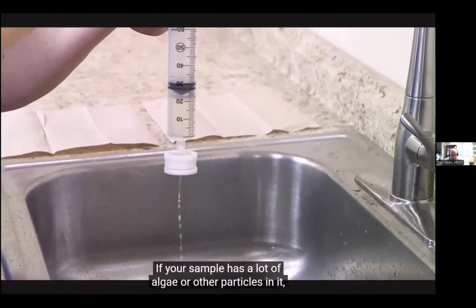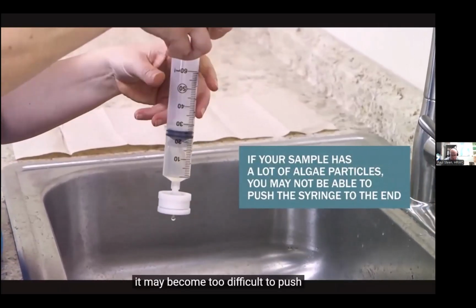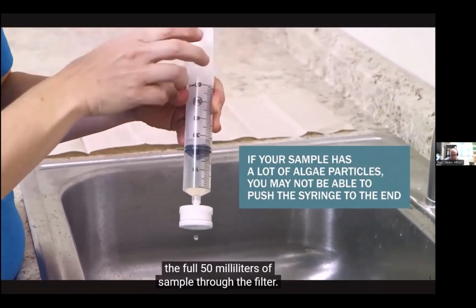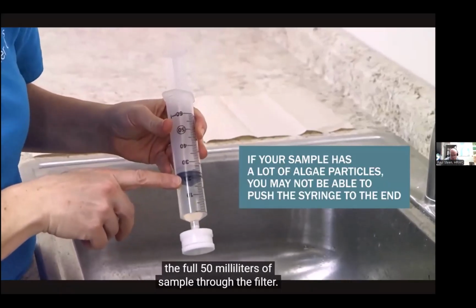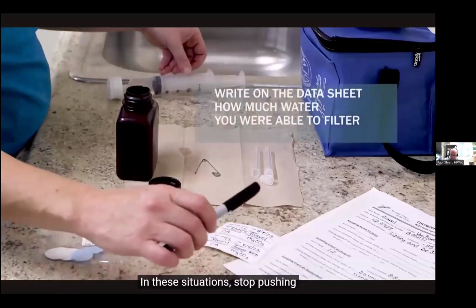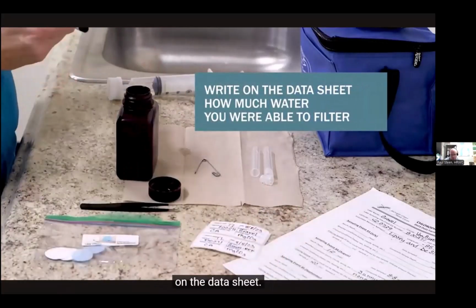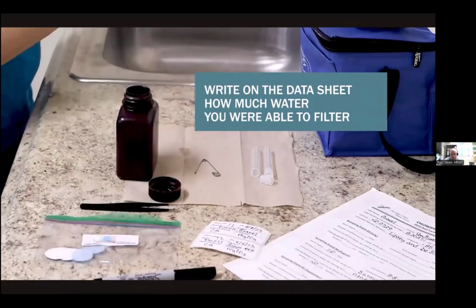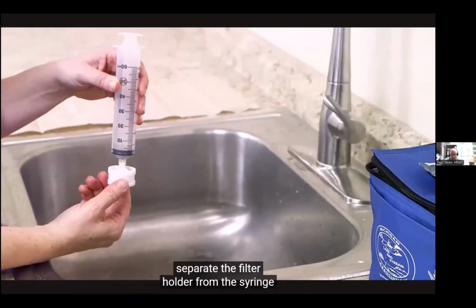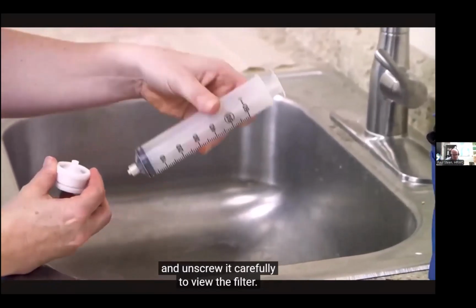If your sample has a lot of algae or other particles in it, it may become too difficult to push the full 50 milliliters of sample through the filter. In these situations, stop pushing and note how much water you were able to filter on the datasheet. After filtering the water, separate the filter holder from the syringe and unscrew it carefully to view the filter.